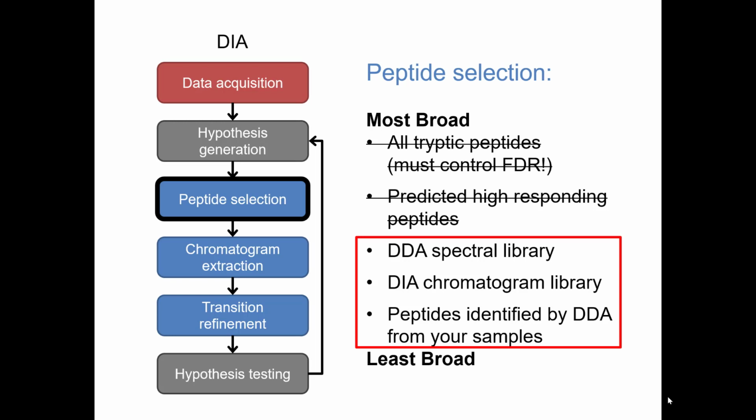So if you take your sample, inject it using DDA, and then inject it using DIA one right after another, you can relatively easily transfer your detections in DDA to your detections in DIA. Because it's the same retention time and same fragmentation pattern, you know exactly where it should live, and you can move that interpretation over immediately. This requires twice as much sample, right? So that's bad. And you're also limited to only the things you can detect with DDA. But it is a way to actually get a DIA workflow off the ground with relative ease.